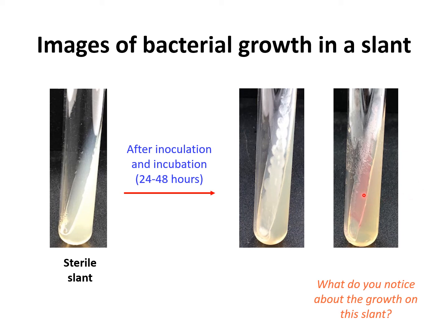So it turns out that there are some bacteria that, when they grow, release a certain pigment, okay? So some bacteria are going to look white, and some of them are going to look pink. That's the pigment that they produce.